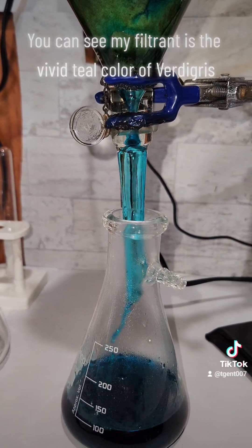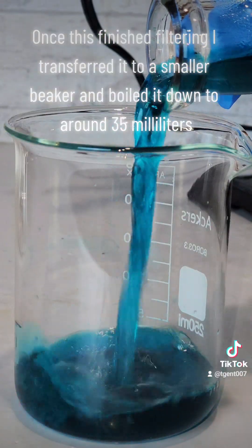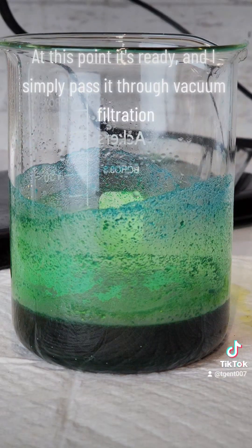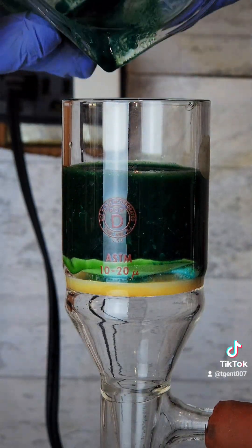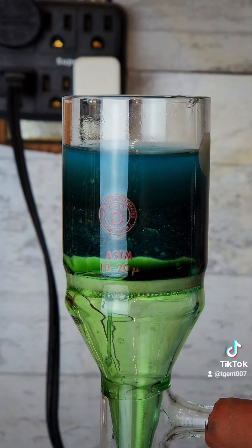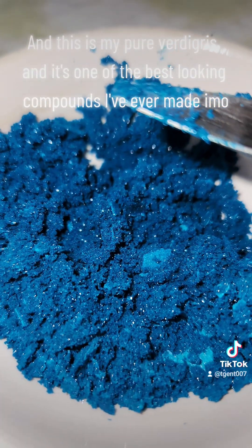You can see my filtrate is the vivid teal color of verdigris. Once this finished filtering, I transferred it to a smaller beaker and boiled it down to around 35 milliliters. At this point it's ready, and I simply pass it through vacuum filtration.